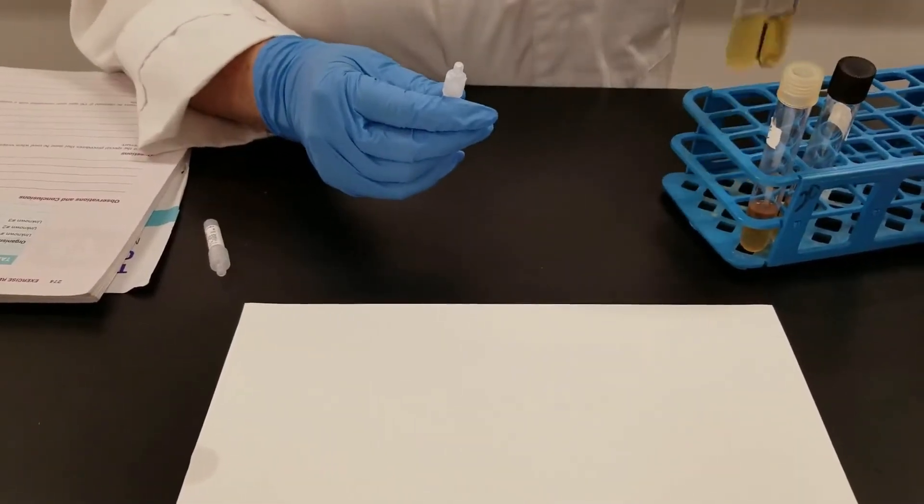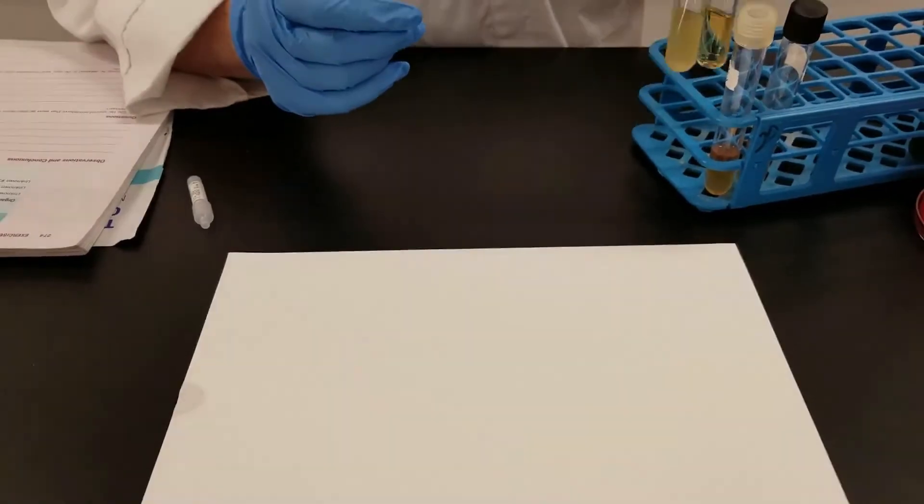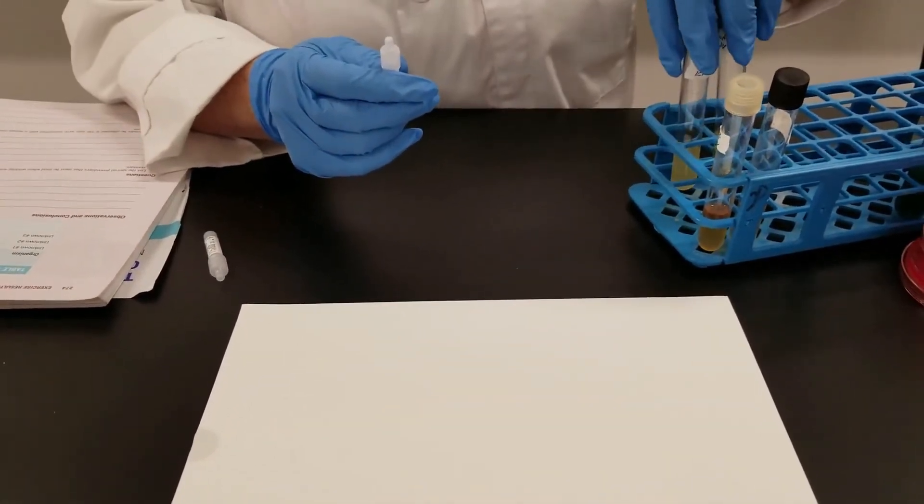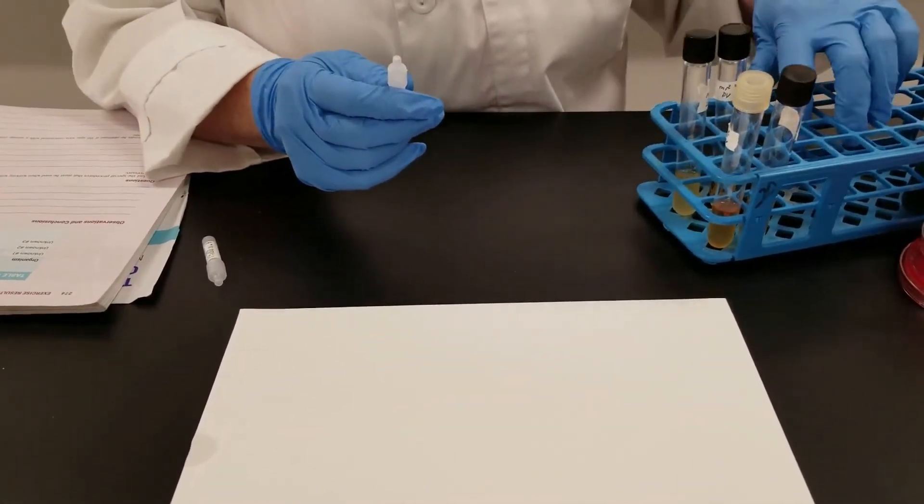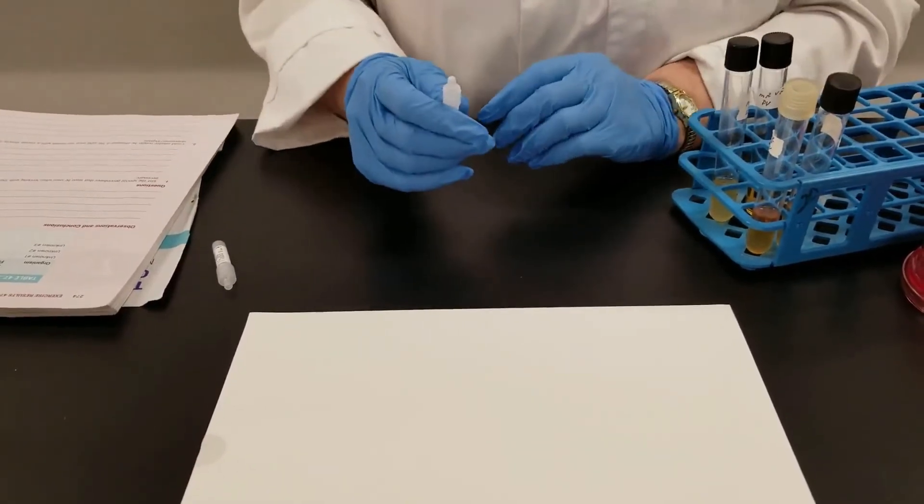The next test we are going to do is the VP, Voges-Proskauer test. Usually the media is the same as the MR, so you need to remember whenever you inoculate, MR and VP go together, which means you need two tubes - one for the methyl red, one for the VP.